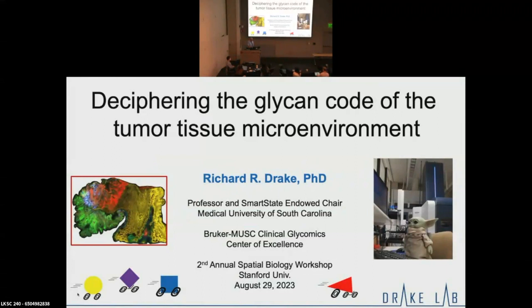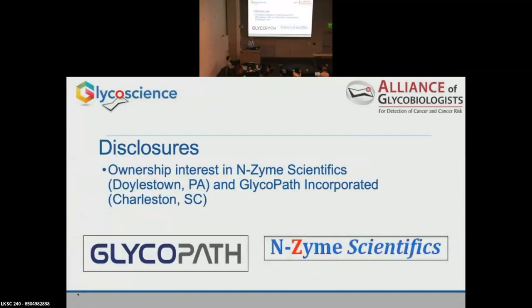Jeff and Peggy did a great job of setting up the method, so I may blow through a couple slides, but I'll put it in context. And as Peggy mentioned, a lot of times we'll run the glycans and then pass the slide over because it just gets them out of the way for everything Peggy just showed you. So we can do data integration pretty routinely. Very briefly, we've spun a couple things out around this technology, especially on the glycan side.